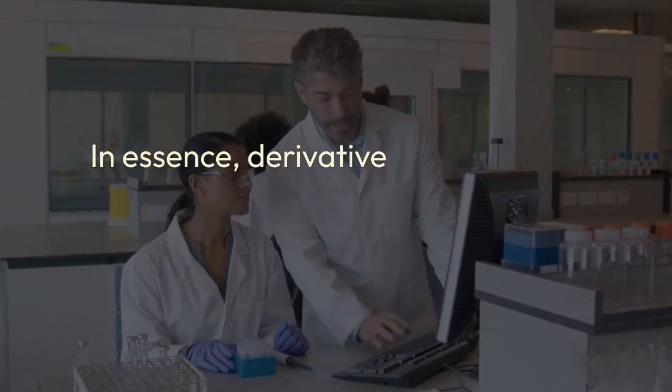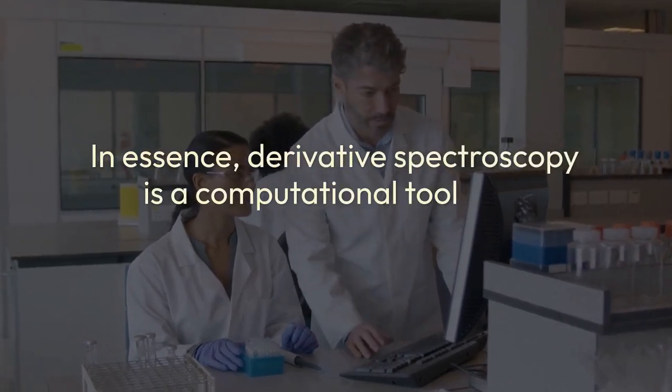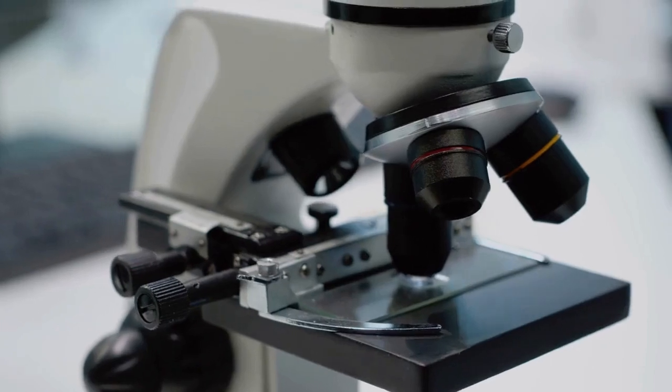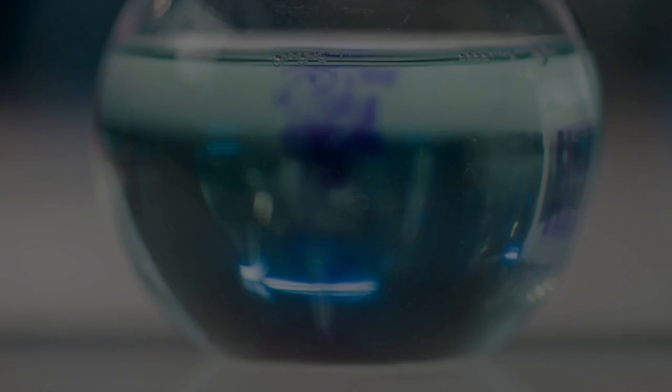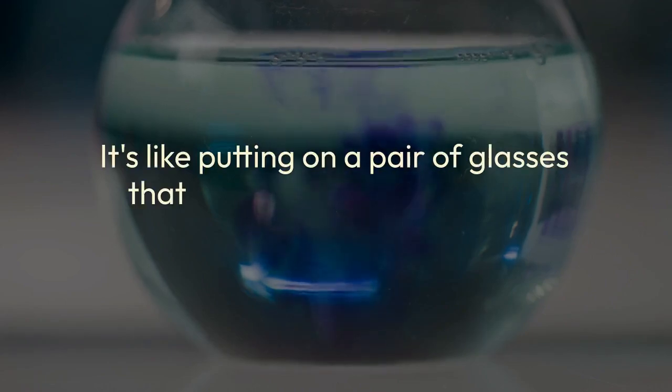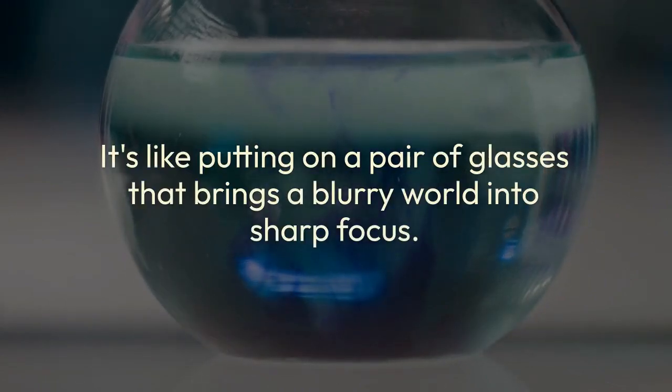In essence, derivative spectroscopy is a computational tool that sharpens our vision, allowing us to see the fine details within complex spectral data that the naked eye would miss. It's like putting on a pair of glasses that brings a blurry world into sharp focus.